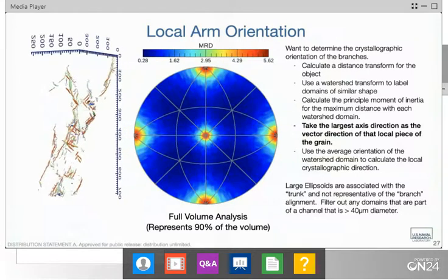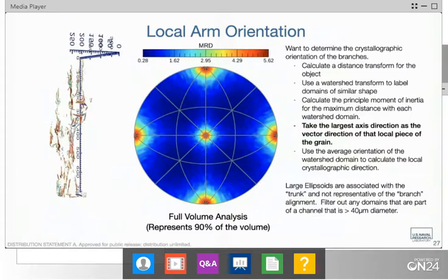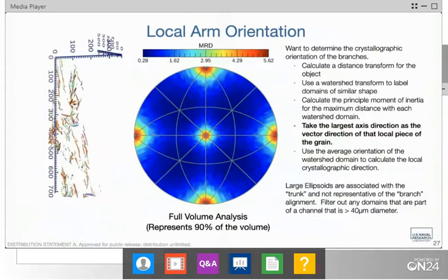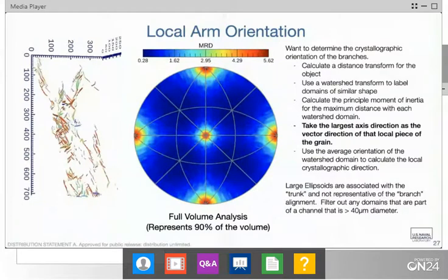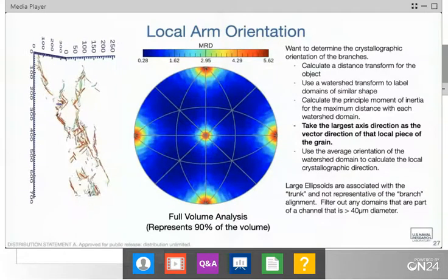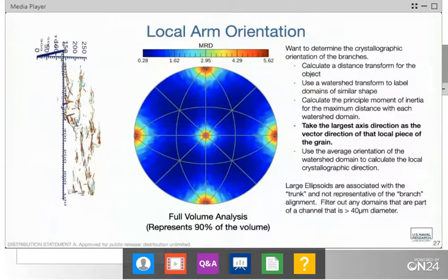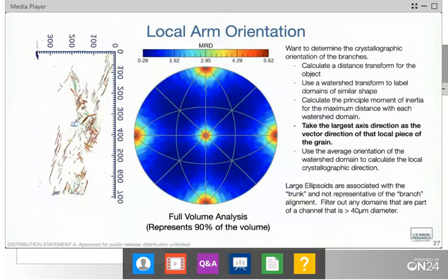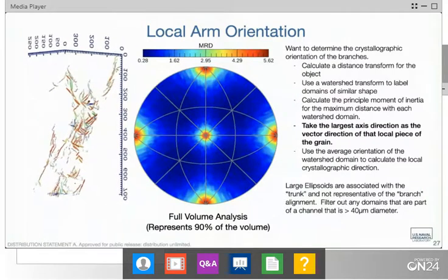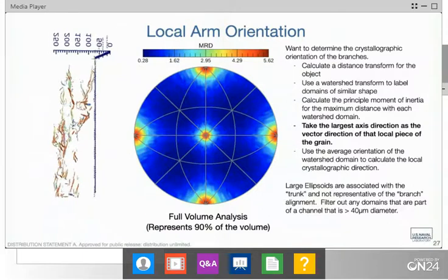So in the case of our 3D reconstruction here, we were putting in fiducial marks and we would have to replace those approximately every 10 times. That was very advantageous from the standpoint of that's about how many we could do in one day. So that meant that every day we'd have to have somebody come in, pull the sample off, and do the indents. We didn't have an automated indenter that would do that for us, but you could certainly conceive that something could be constructed to do that.